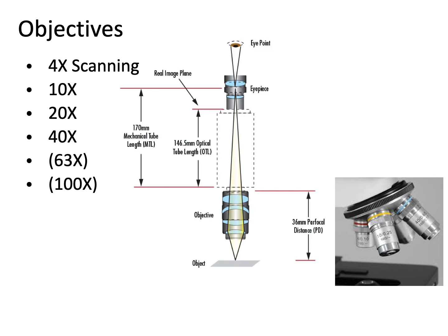But as the objectives get higher magnification, they tend to switch to oil immersion, where you use oil on your slide, on your sample, that creates the interface between your sample and the lens. And we'll look at why that is. So to get more to the heart of resolution, keep in mind that objectives have different magnification strengths.